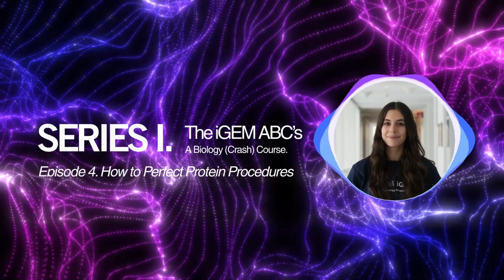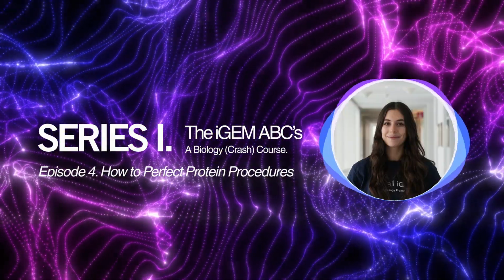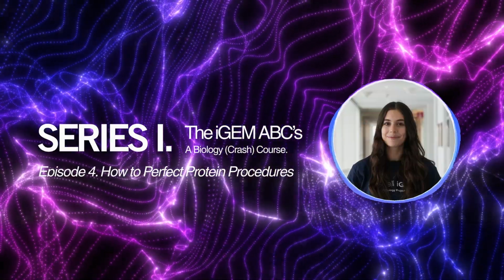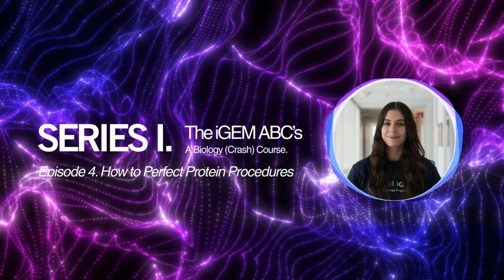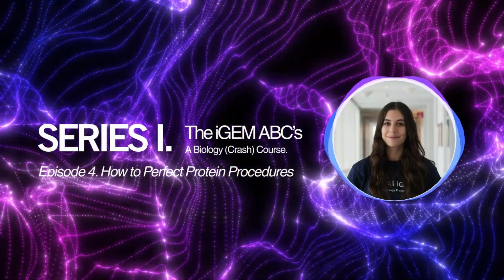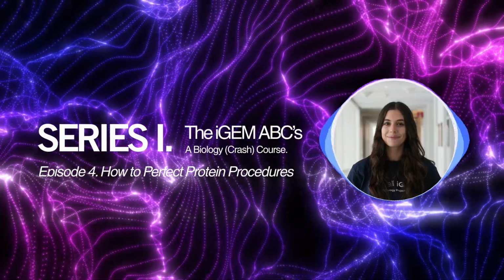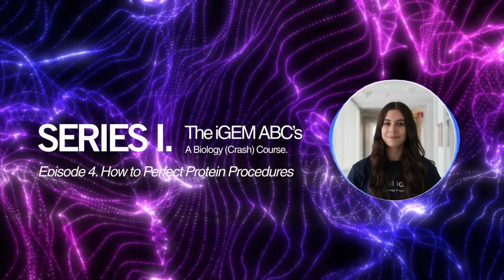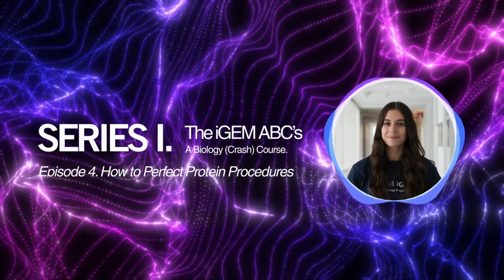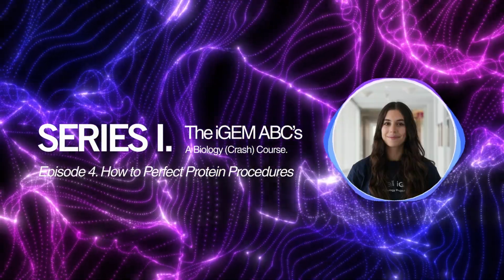So if we run our clarified lysate through a nickel or cobalt column, the histidine-tagged protein of interest will bind strongly to the column, while most other proteins that don't have this sequence of strong transition metal coordinating histidine residues, they'll flow straight through. There's always a possibility that another protein might bind weakly to the column through one of its histidine residues, or maybe through some kind of other coordinating atom, and this is why we follow up the initial flow through with a wash, which is when you basically flow another buffer through the column.